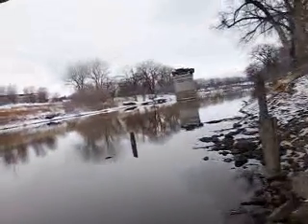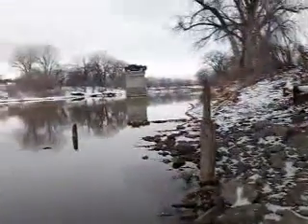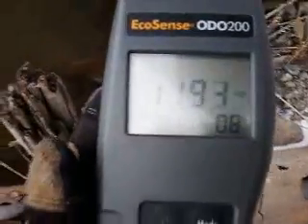So this is Grand Forks and East Grand Forks. I'm on the East Grand Forks side. And today is some kind of a parade and testing the dissolved oxygen. I tried to reach it from the top of the bridge, but the water was too low.